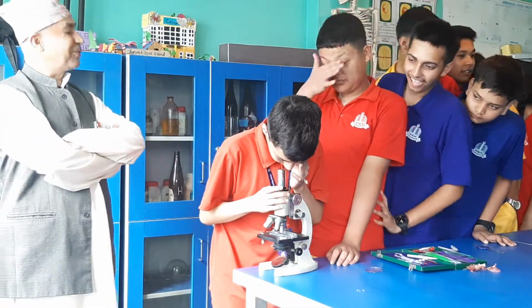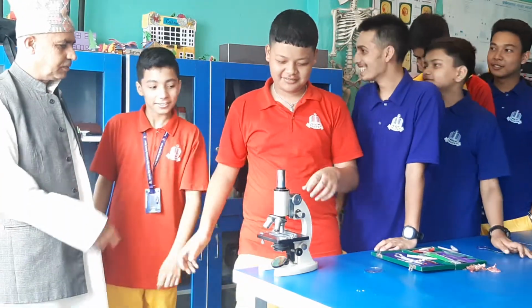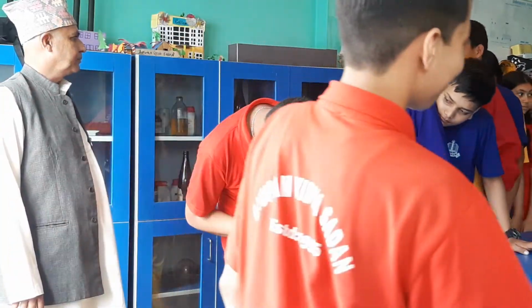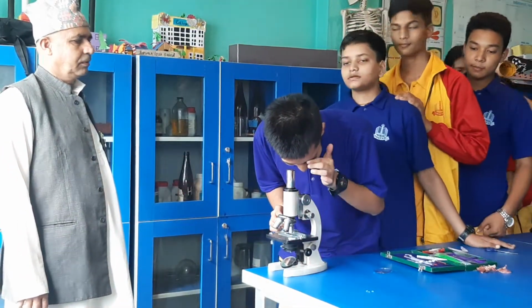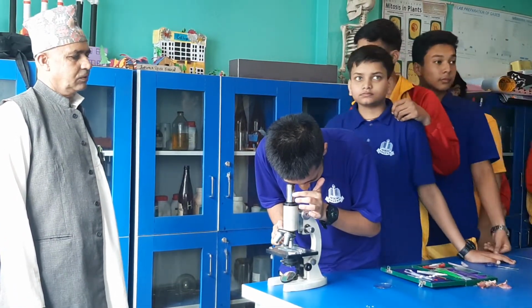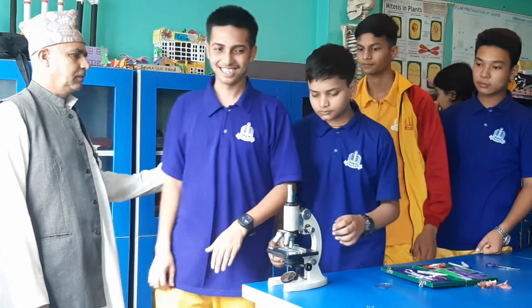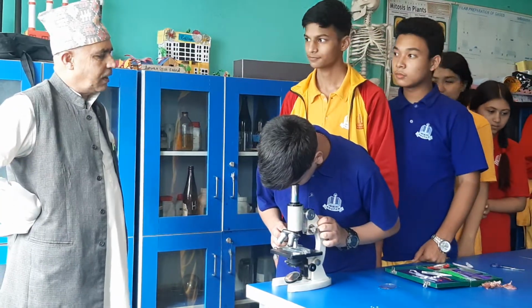But you must know how to close one eye. Some people like it, no. You see? Samir, you can move this forward and backward and then you can just take it right and left. Whether there is little bit clear image or not. Object is there now. We can see the image on it. See? So it is really bright light.